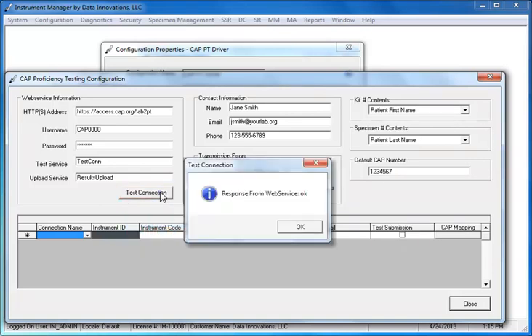If the connection is established, you will see an OK message indicating that the instrument manager has been successfully configured to communicate to the CAP.